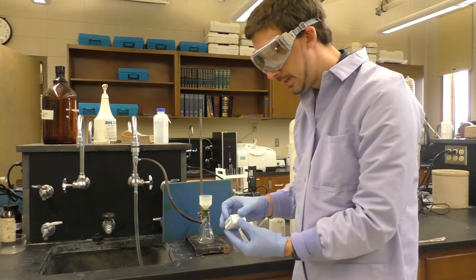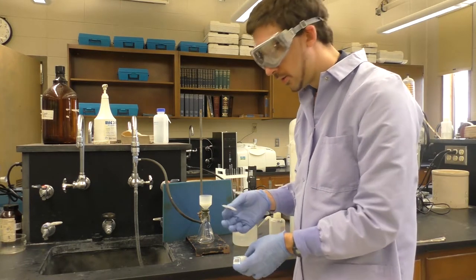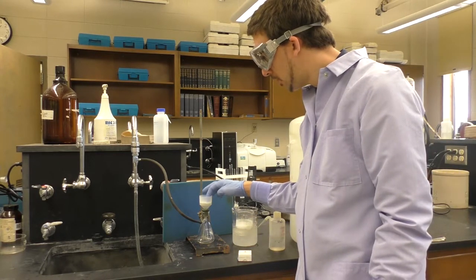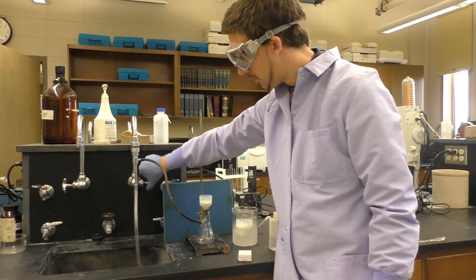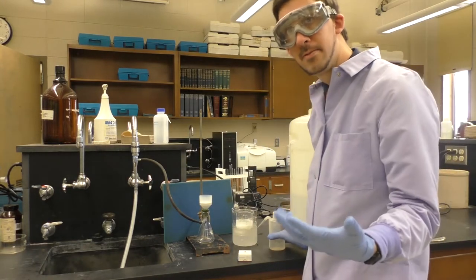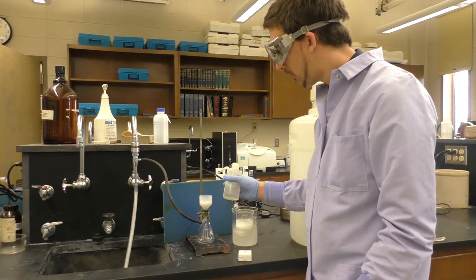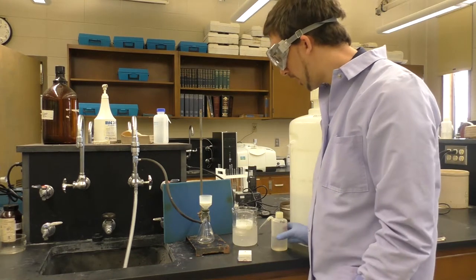I'm gonna take a piece of filter paper. The process is very similar to using the Hirsch funnel. It's just a slightly larger scale. I'm gonna take a piece of filter paper, put that onto the Buchner funnel. I'll turn on the water aspirator. And then I want to wet my filter paper, make sure that it stays really adhered to the filter. So I'll wet that with some distilled water. That should be good and sucked onto that filter now.